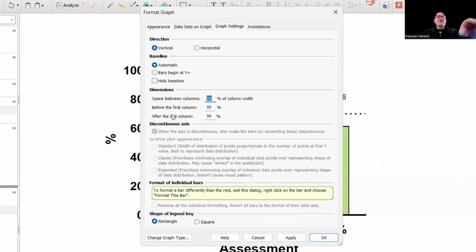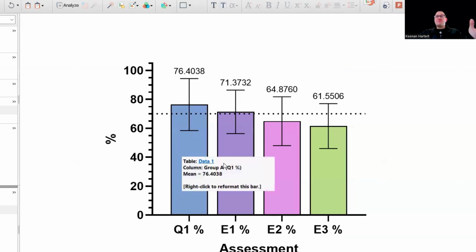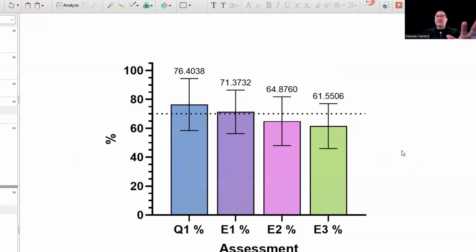You know what I'm talking about? Best thing you can do here, I really like getting rid of that space between the graphs and see how that really gets rid of more white space there for me, makes things really clean. Absolutely love it. I'm going to save this for later. I'm going to move on to our next thing.